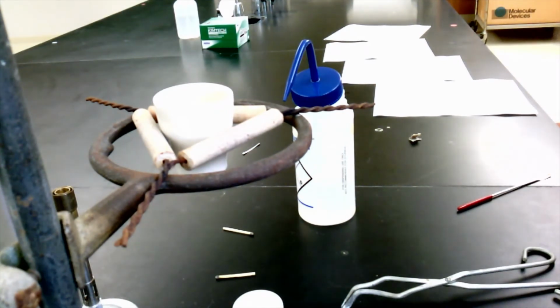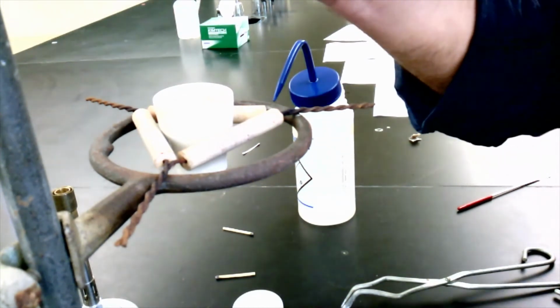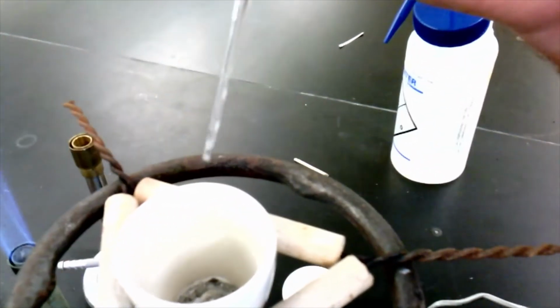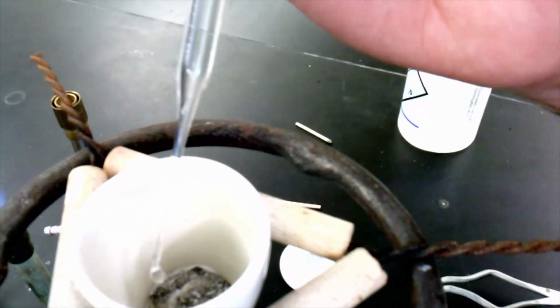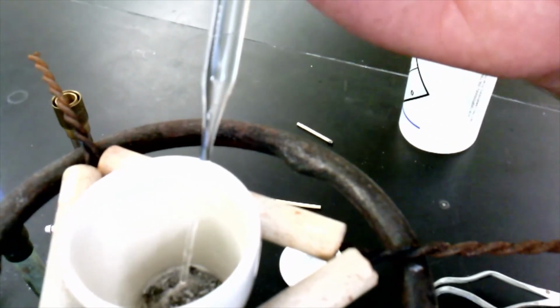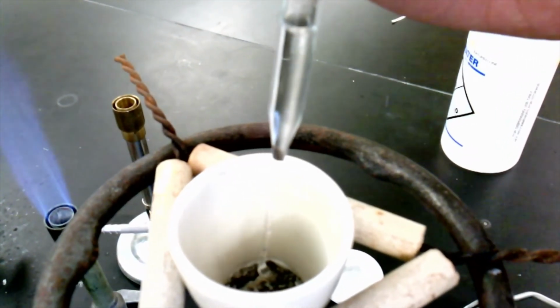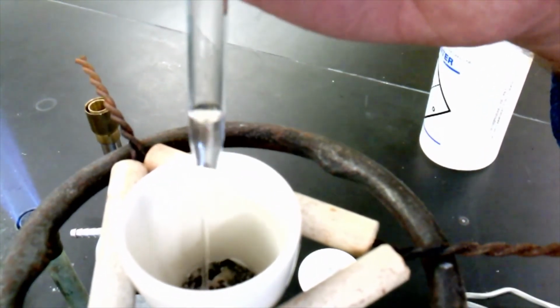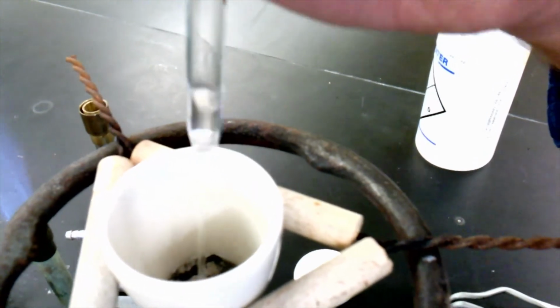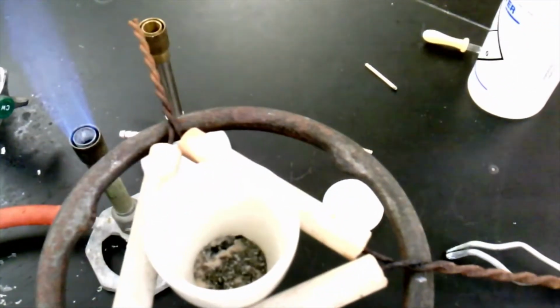So let's add a couple of drops of water. Okay, I'm going to go into my squirt bottle with my dropper. You can see it, nothing. If I did this right, nothing exciting should be happening. Okay, I don't want to see anything happen here. All I want to do is gently moisten everybody in here, because if there's any magnesium nitride, I want the magnesium nitride to see some of this water. Okay, so it can then be converted over into magnesium hydroxide and then magnesium oxide.